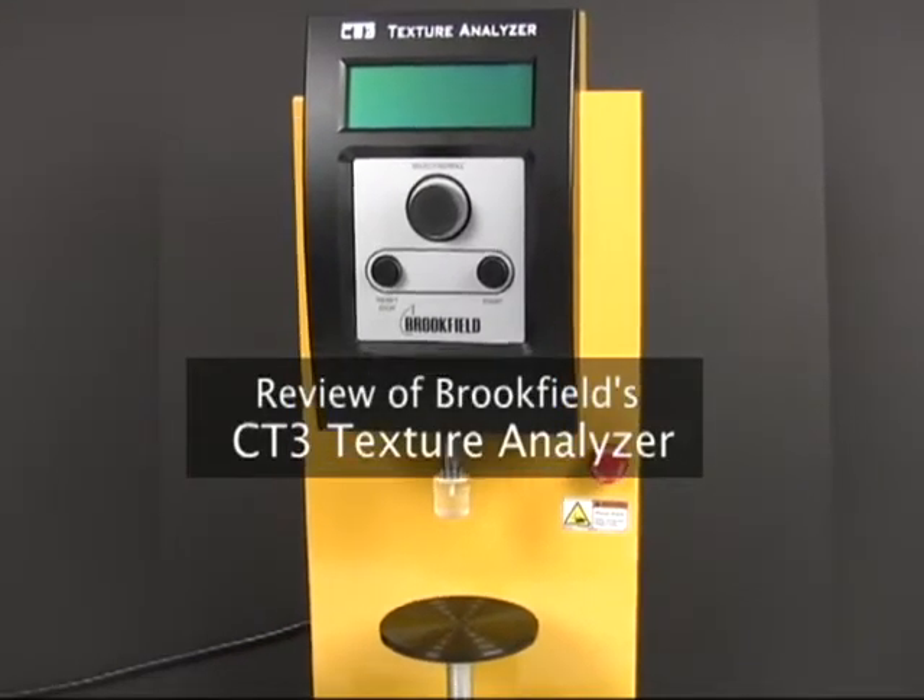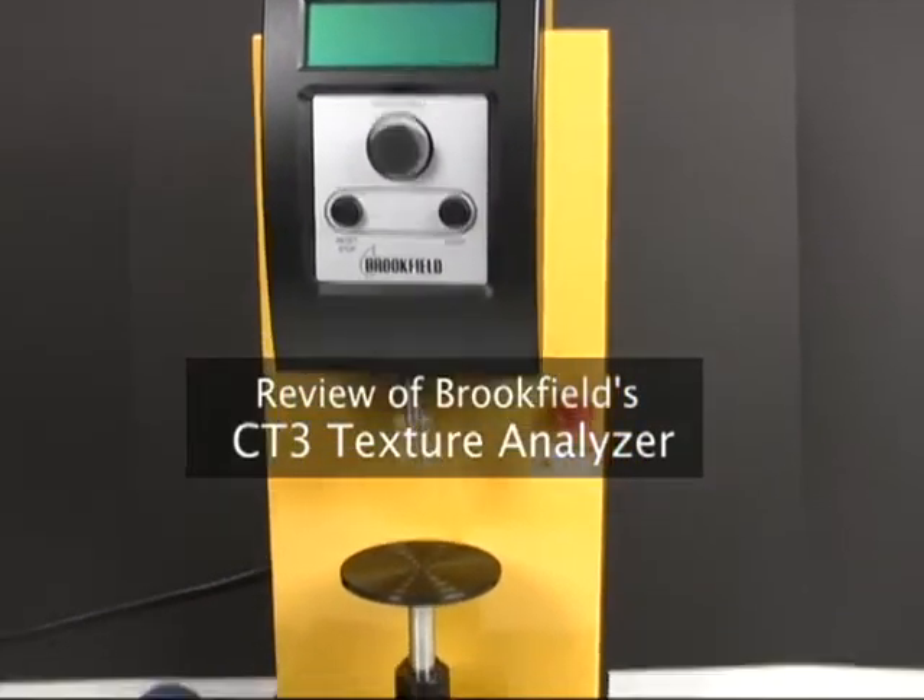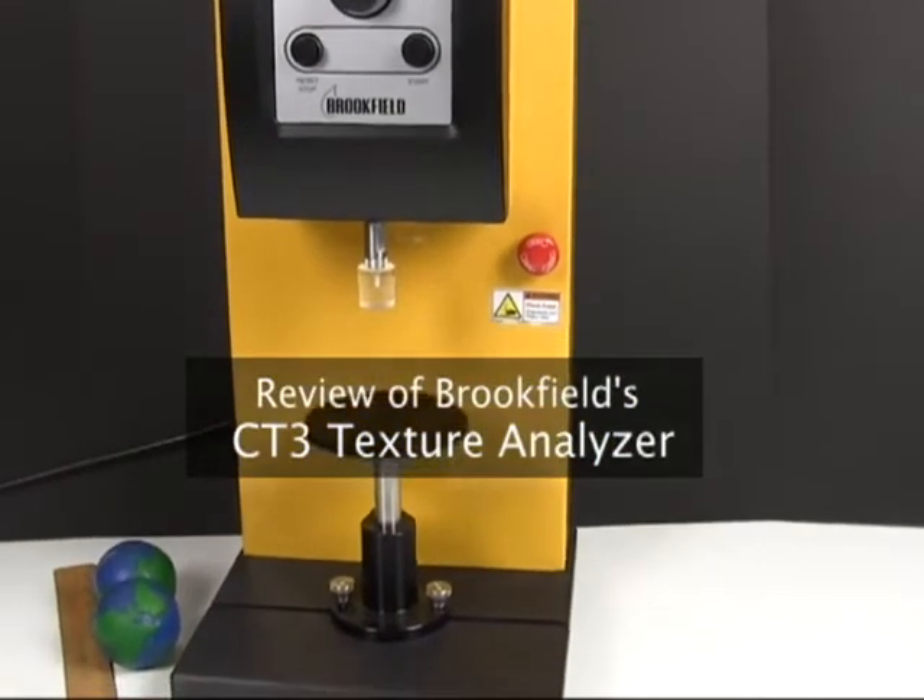I've been learning how to use the Brookfield CT3 Texture Analyzer, and figured I'd do a quick demo and commentary on it.